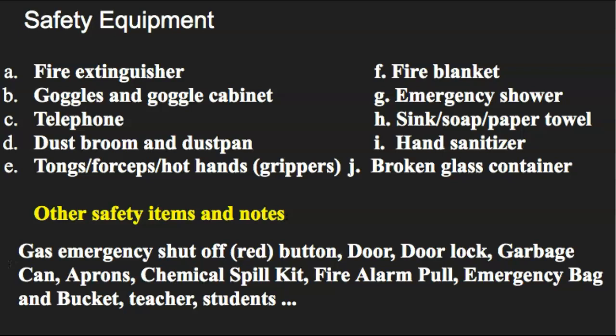The door lock can protect us from things that shouldn't be in our room. The garbage can. If you have a messy work area, or a mess on the floor, that means people can slip and trip. That's not good. People can get things on their hands that shouldn't be on their hands, so please make sure you throw away any material that doesn't belong on the floor or your work table or your work area in a lab.